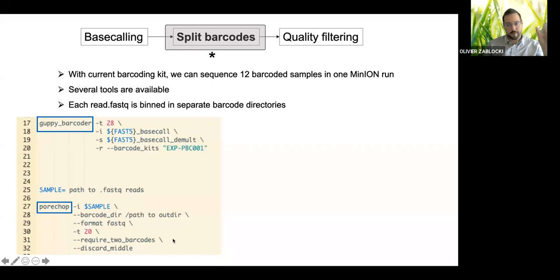So the 5' end and 3' end of the DNA sequence needed to have these barcodes, and it looked at mishappenings in some of the physics of the library prep and the sequencing, where sometimes you would have 2 reads being read in a row, such that you would have a barcode in the middle of a read when you see it after it's been base called.